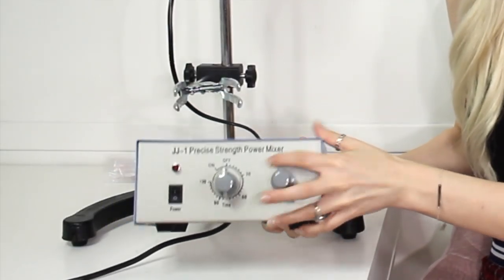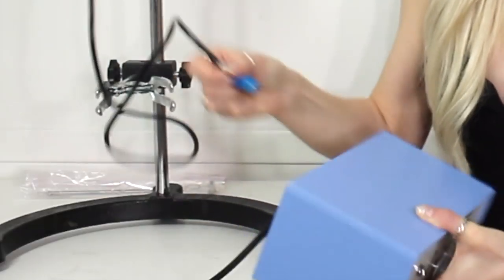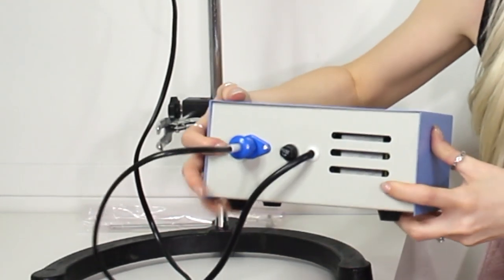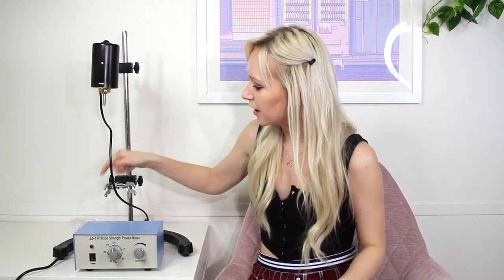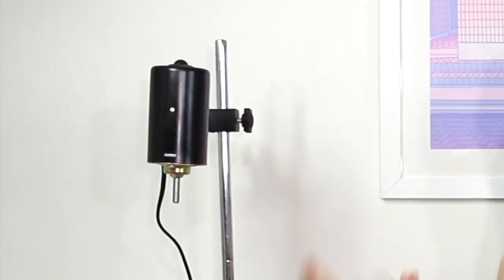Here is the actual power box. There is this cord right here that plugs in as the actual power, and then there's this cord here attached to the actual machine that you have to plug into the power box. This back metal box actually pushes in, which isn't good — it kind of tells me this is probably a used machine, and that makes me question how much longer it's going to actually last.